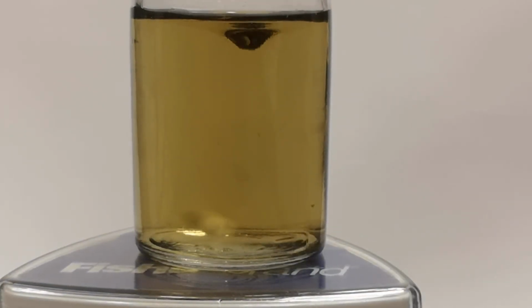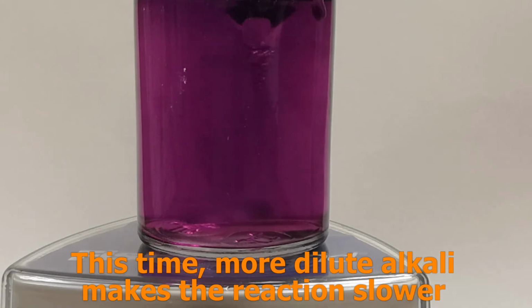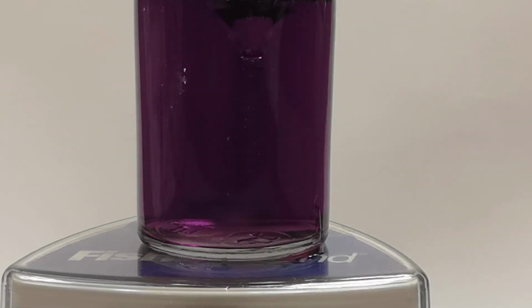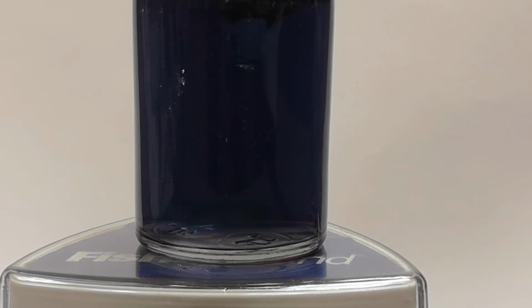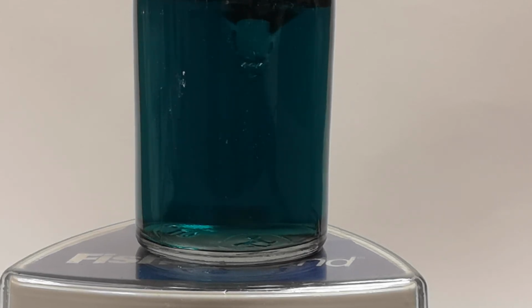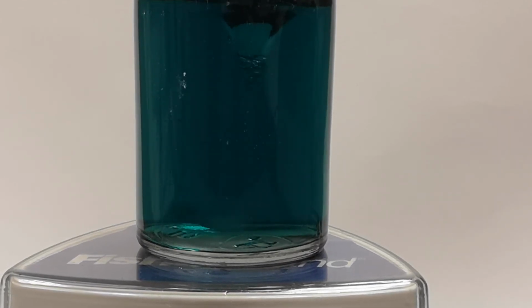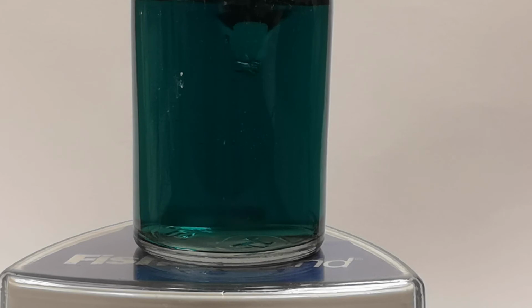The solution now slowly changes from green to yellow. Now this is interesting, because the yellow is due to nanoparticles of manganese 4 oxide. Manganese 4 oxide is most commonly met as a black powder which is completely insoluble in water. However, these nanoparticles are so small that they remain suspended, and the colour depends on the size of the particles. And even though this is not technically a solution, it looks clear.